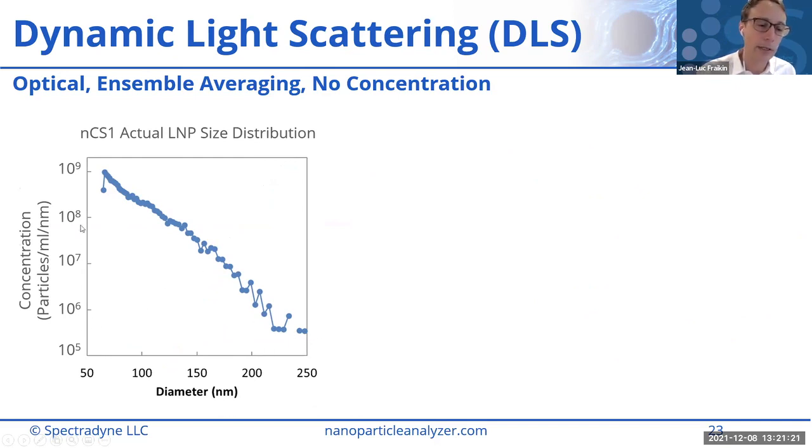We've got concentration on the y-axis in absolute units. And you can see, note also it's a log axis here. So we've got 4 orders of magnitude of concentration spanned in this sample, roughly. So what would this sample look like in DLS, do you think?